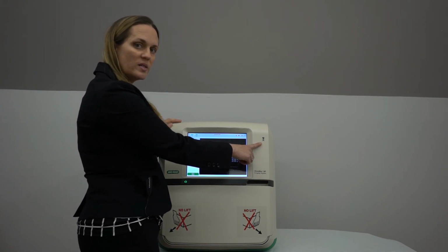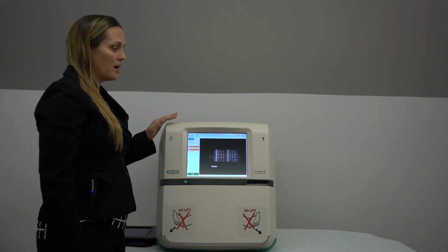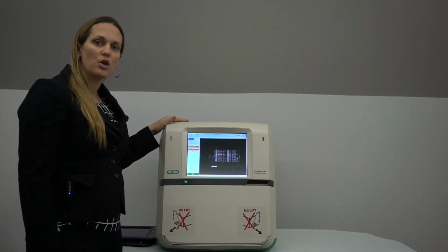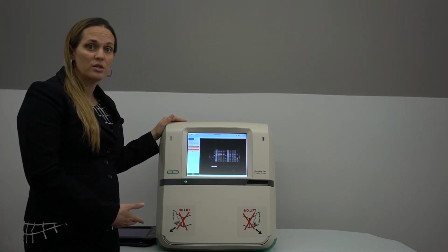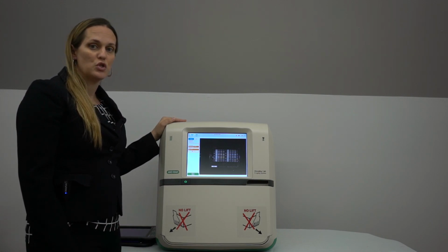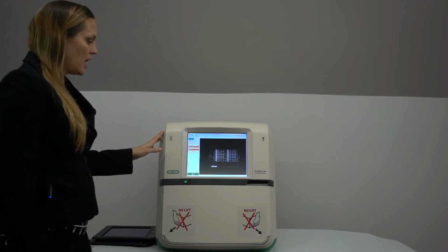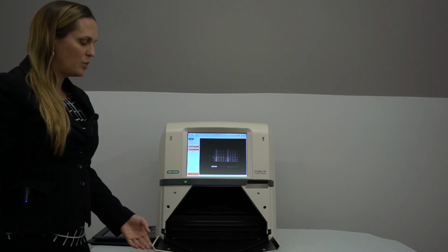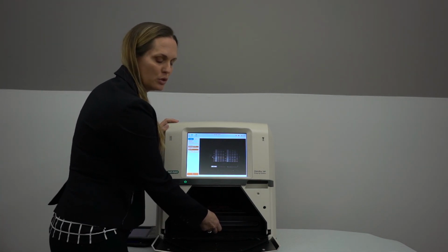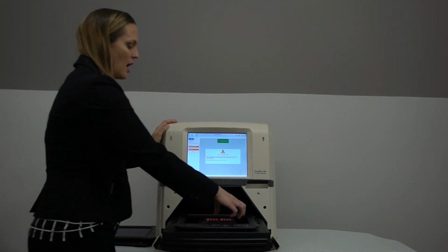As you can see, there's a USB port here. There are also 3 more USB ports in the back. So this can be used to take your images off of the imager, and you can also have this networked to a drive so that the images can be put there as well. So basically, there's a magnetic door that opens in the front, and the transilluminator tray slides out as so.